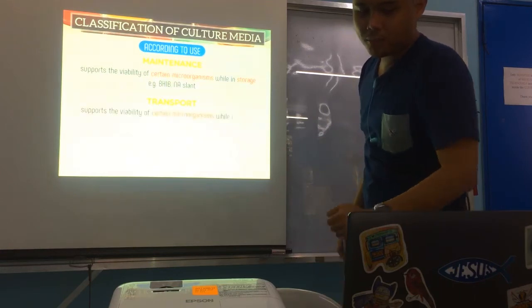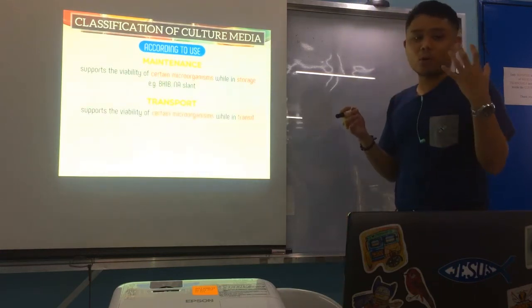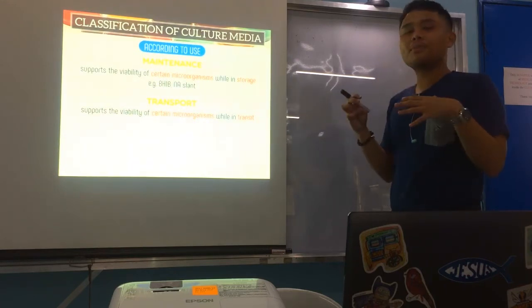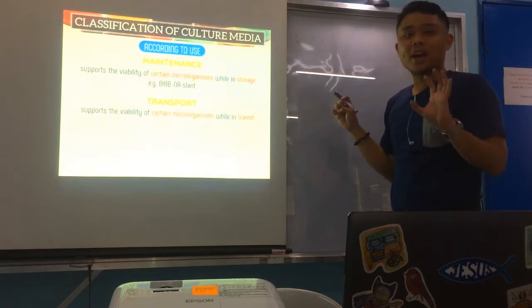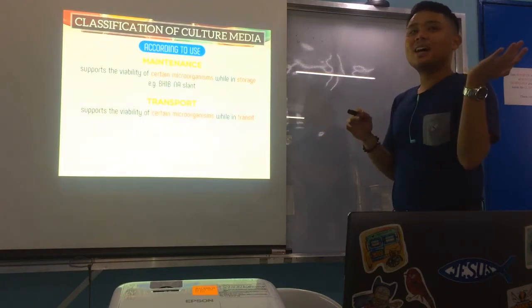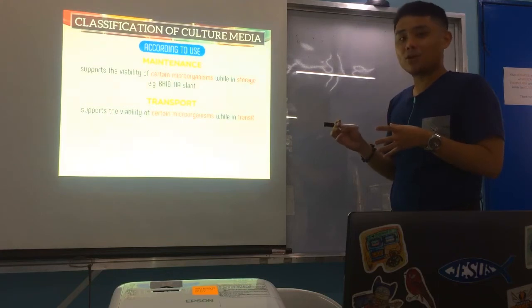And next is, of course, you have transport. For transport, these are culture media used for organisms while in transport. Basically, because there are times the specimens are far from the lab. So, example, an outbreak of diarrhea from Bais, and then the testing is in Dumaguete. So, it's quite a long time to travel.